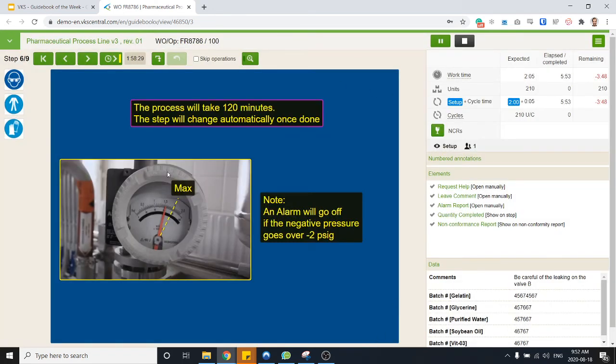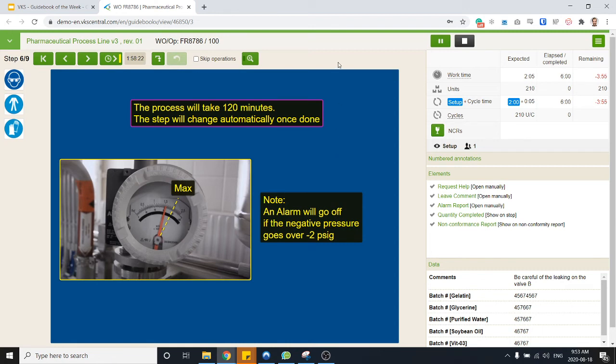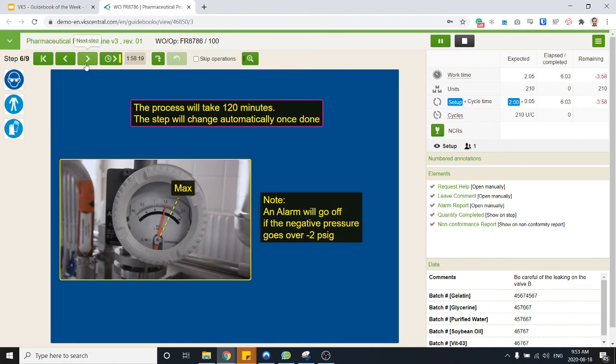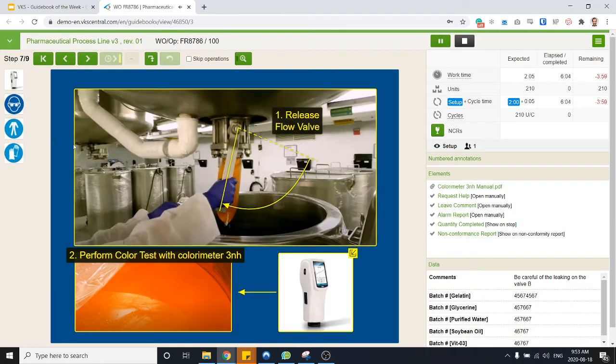In this case here automatically the work instruction will move on to the next step after the two hours. We don't want those videos to be too long, so obviously I'm going to skip over to the next step.